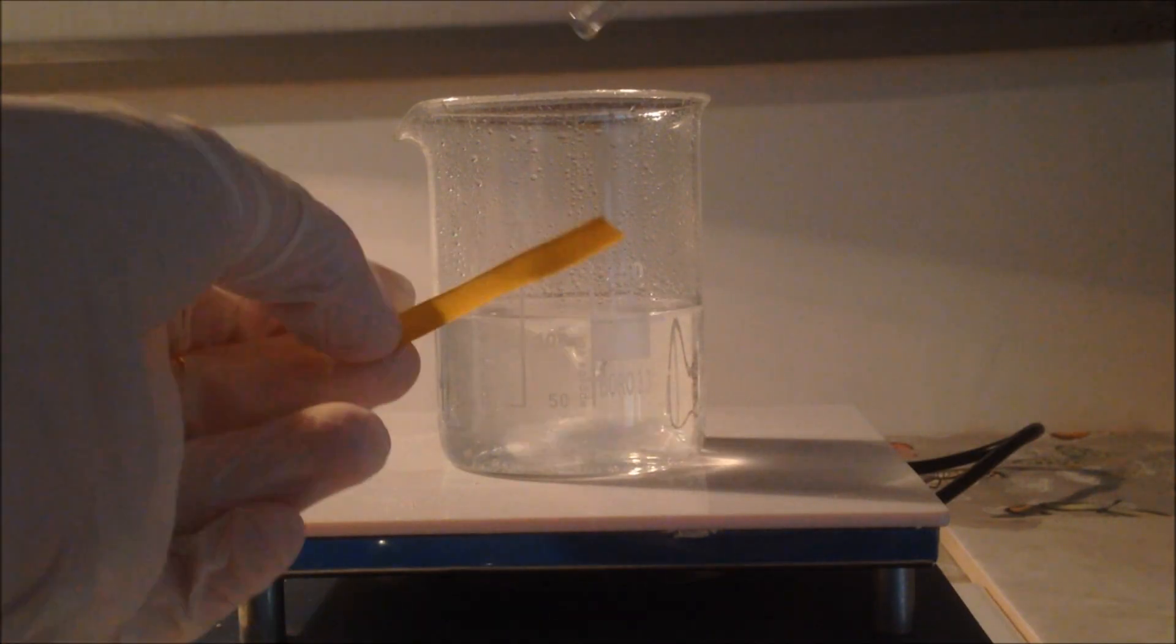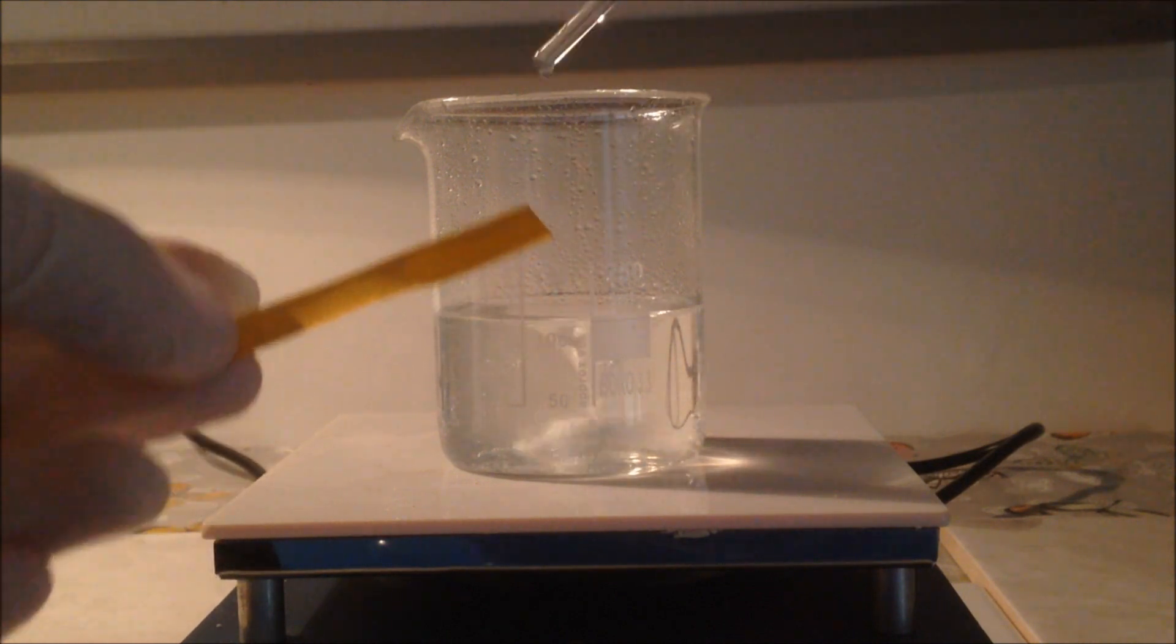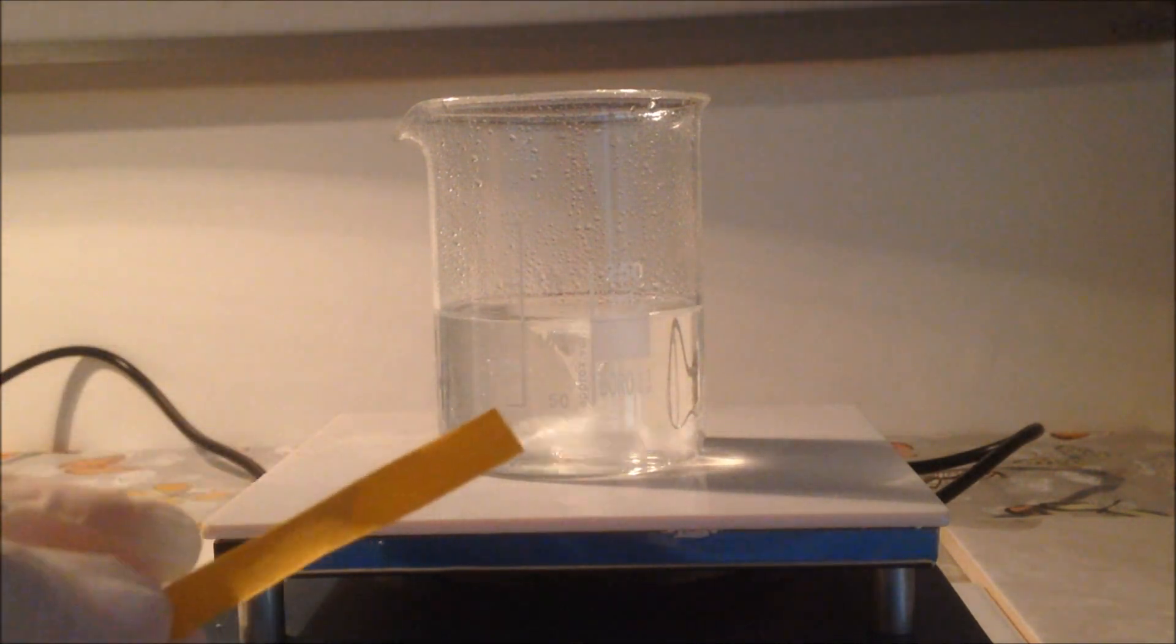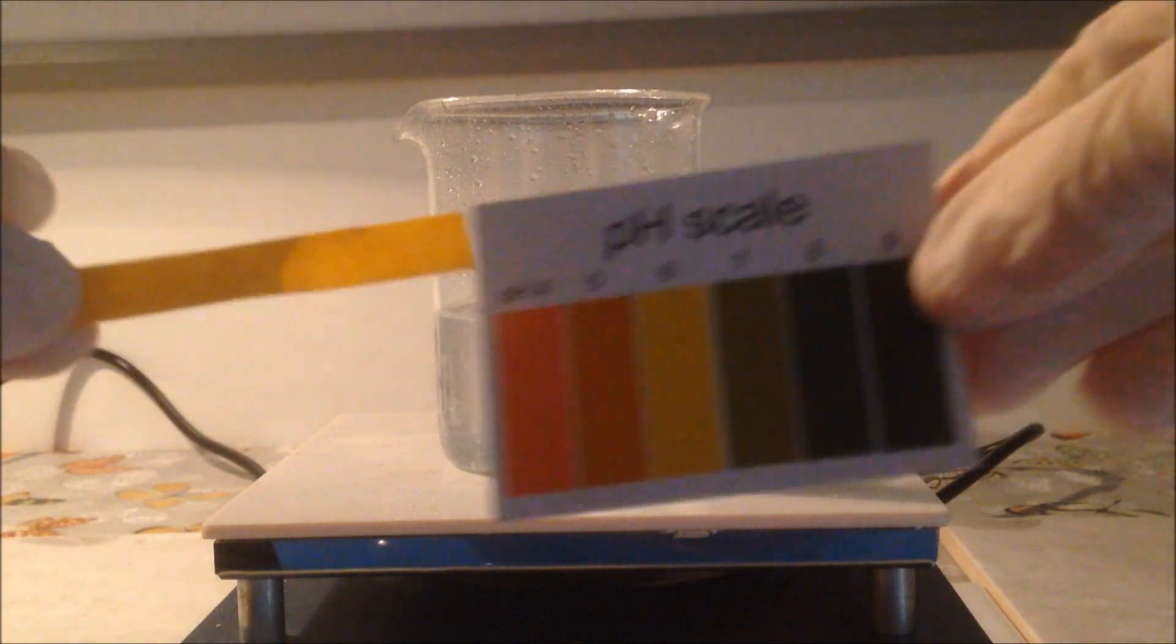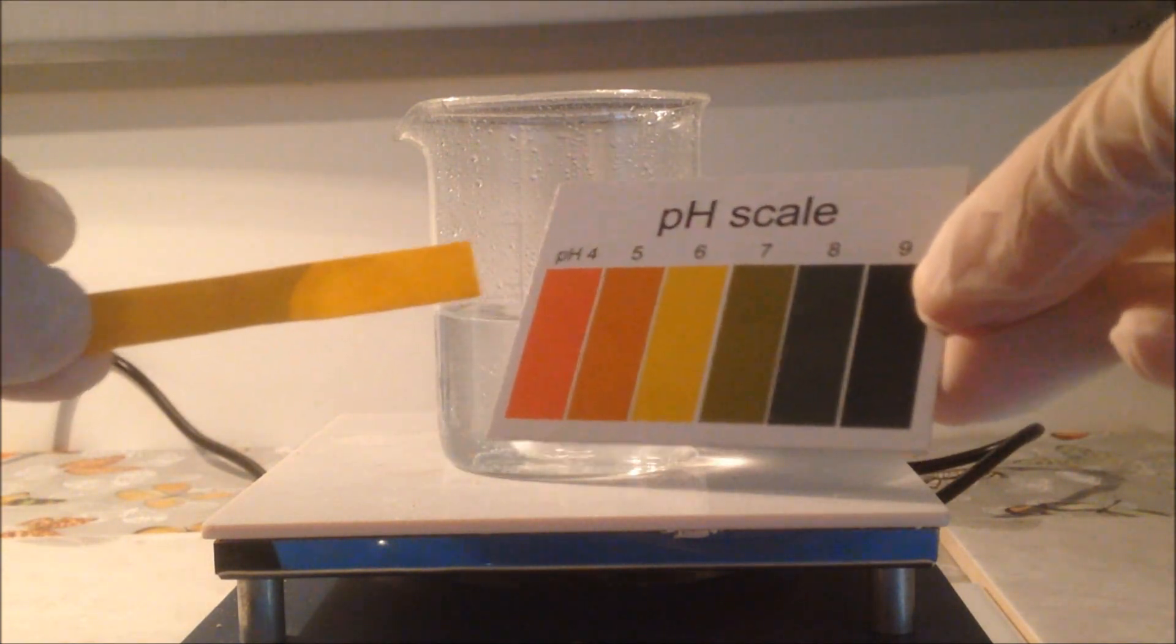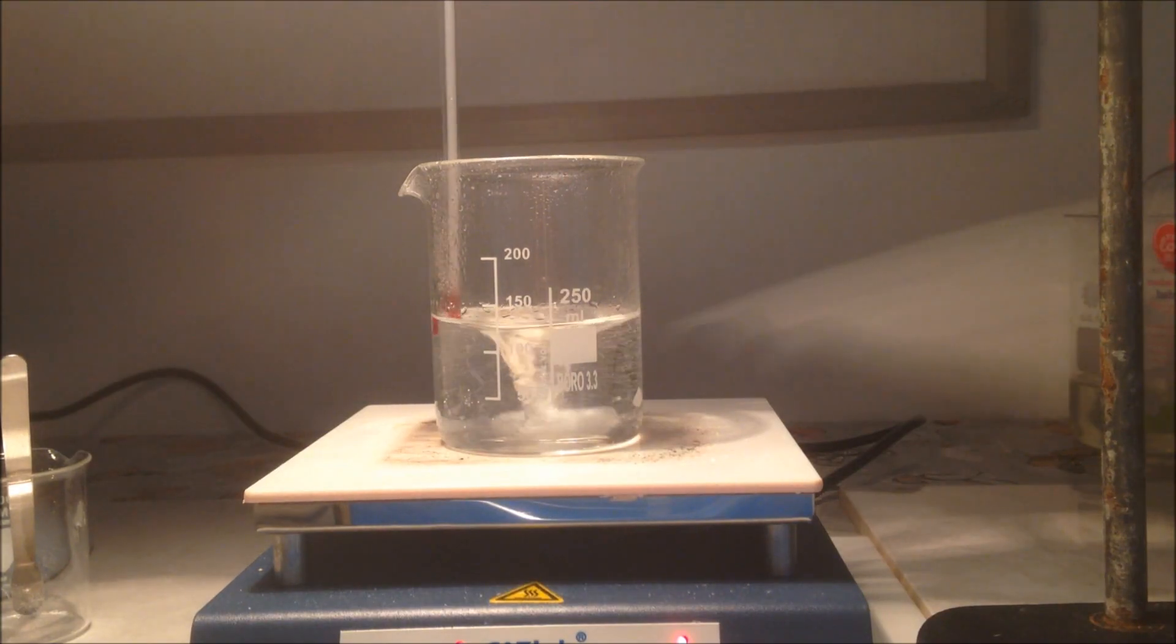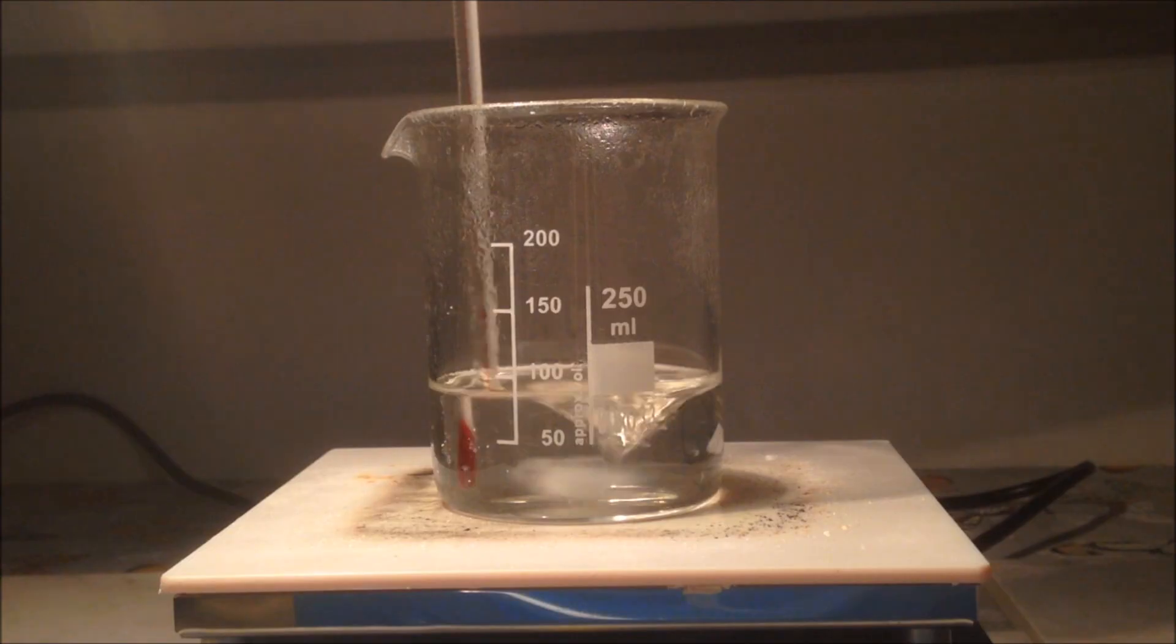Because of some dodgy scales, I wasn't sure how much mass of each reactant I had, so I used pH paper to keep track of the pH and see how much citric acid was still unneutralized. You can see here it's about yellow, so there's still a way to go before getting to green neutral, which I eventually got to. I added about 38g in total of sodium hydrogen carbonate at that point, but that shouldn't happen to you.